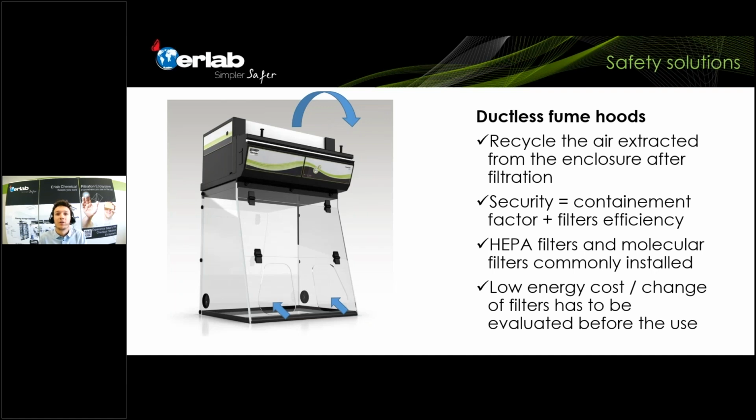And then you ask, of course, the question, where do those chemicals go? Where do those chemical vapors go? Well, they will be adsorbed by an activated carbon filter. If you would use powders or particles, they will be captured by particulate filters such as a HEPA or an ULPA filter. So this is really a completely different technology, which has a lot of different advantages compared to a ducted fume hood. But the main principle is that it keeps you safe, again, by a good containment.